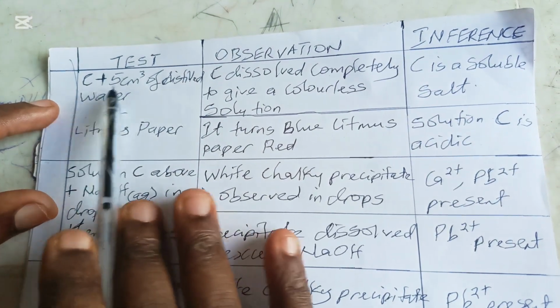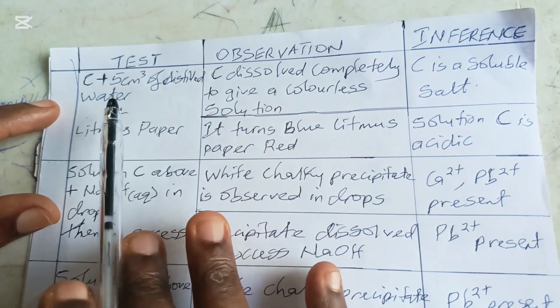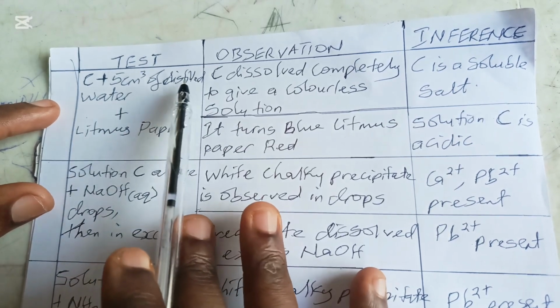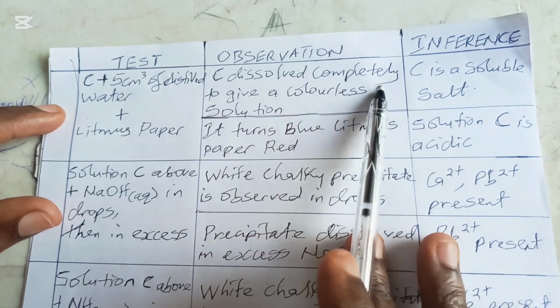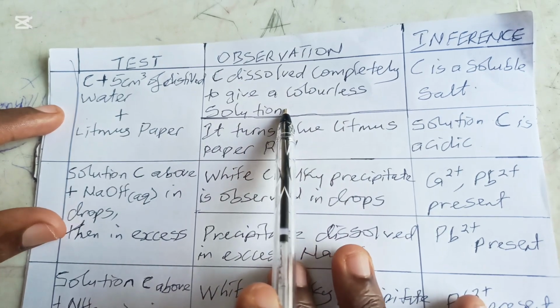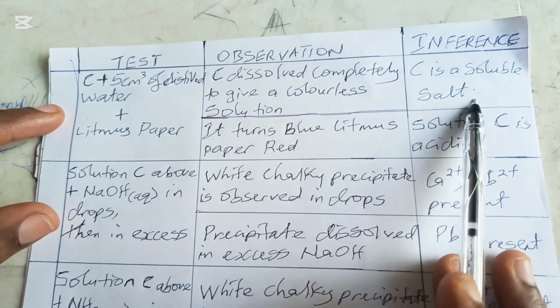Now, C plus distilled water 5 cm cube. In your instruction it might not be 5 cm cube. Please don't just cram it without understanding. When they say you should add distilled water to your C, what you are expected to get is that C dissolved completely to give a colorless solution. In the inference, it will be C is a soluble salt. Since it's dissolved completely, it's a soluble salt.